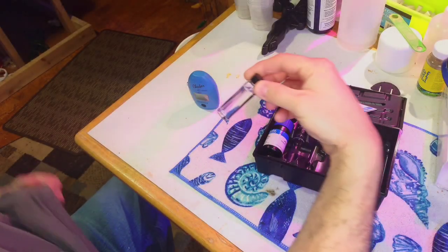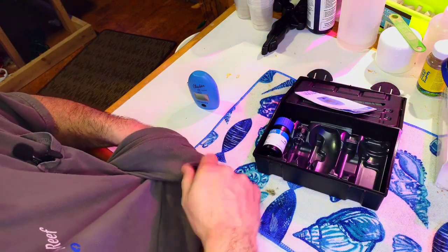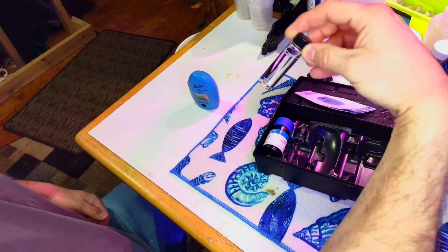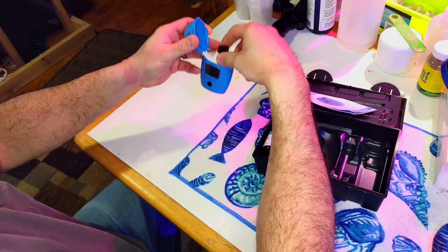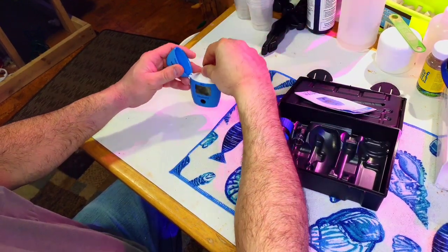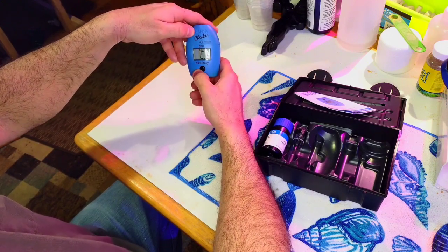Now that we have our water sample, make sure your vial is nice and clean. I use my shirt, but you can use a microfiber cloth — something soft to get off any fingerprints, because smudges will affect the reading. I like to put it with the 10 milliliter mark facing the front every time. They recommend this because any scratches in the vial may affect the reading depending on orientation.